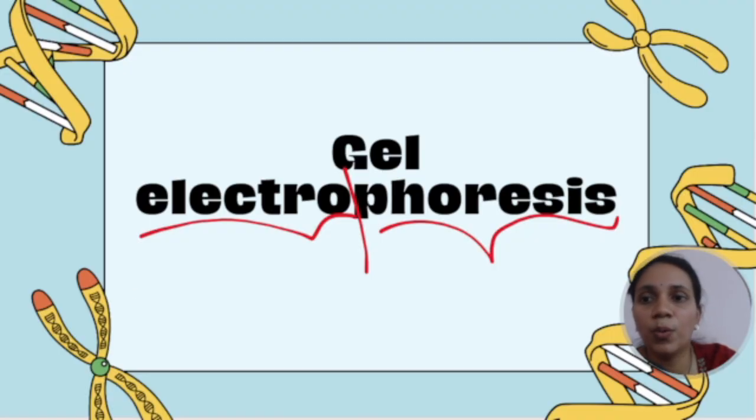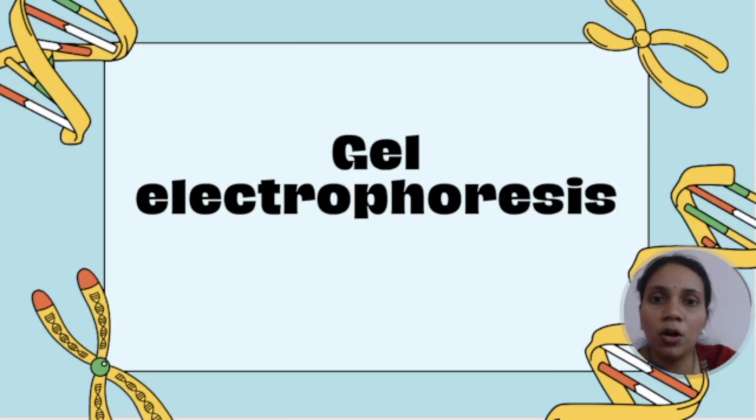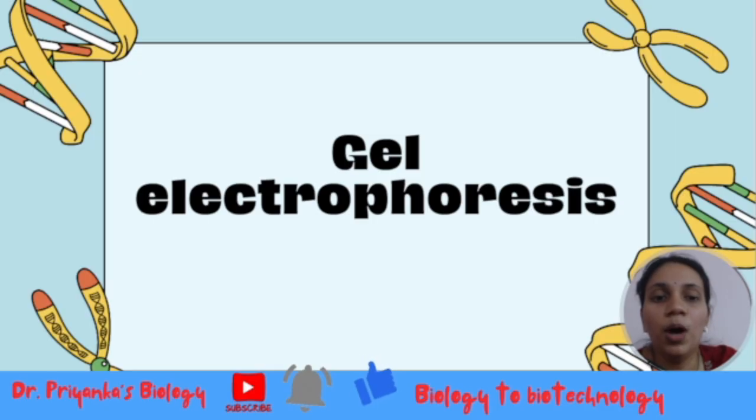So with this, I have tried to make you understand what gel electrophoresis is, and this is what I have spoken about. It will help you a lot in your practical viva questions, because normally the examiners like to question whether you have understood each step and the purpose of each chemical that is used. For my TY exams of my B.Sc, I still remember I was questioned on the composition of the tracking dye. Very luckily, just before entering the practical exam, I had studied it, so I was able to answer it.